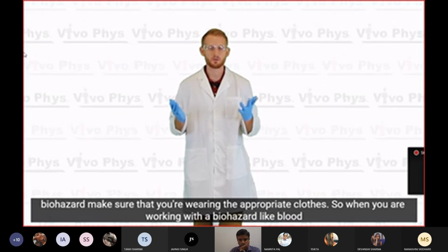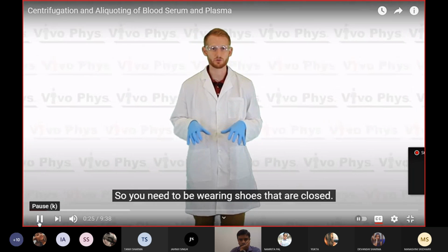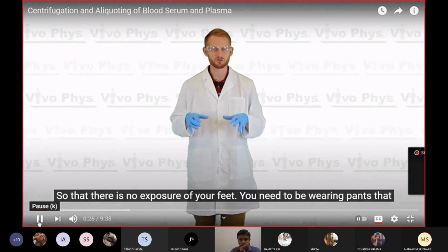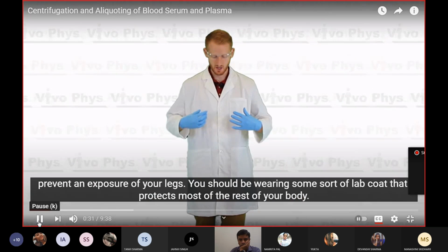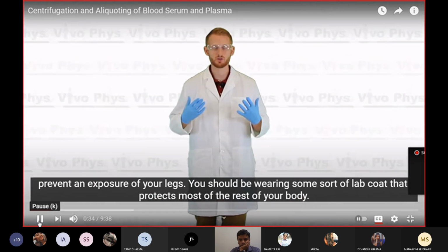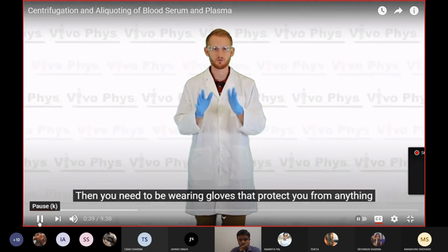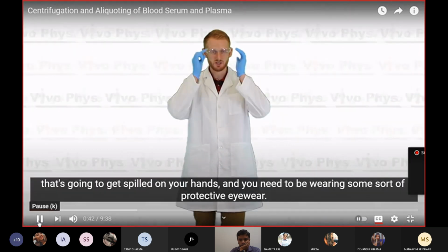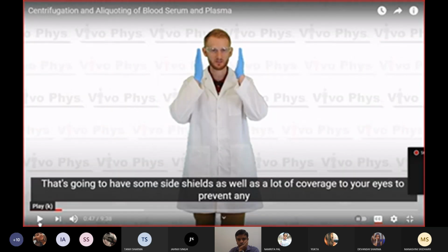So when you are working with a biohazard like blood, you need to make sure that you're protecting yourself from that biohazard. So you need to be wearing shoes that are closed so that there's no exposure of your feet. You need to be wearing pants that prevent any exposure of your legs. You should be wearing some sort of lab coat that protects most of the rest of your body. Then you need to be wearing gloves that protect you from anything that's going to get spilled on your hands. And you need to be wearing some sort of protective eyewear that's going to have some side.